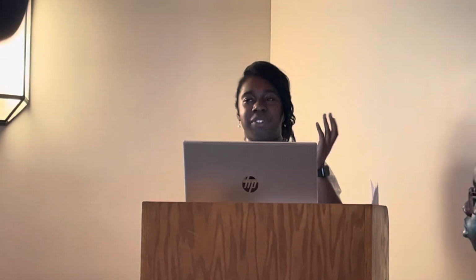And so I guess you're all wondering the big question, did the experiment work? No. So the short answer is no, but the long answer is one of the first characterization techniques that we use is called XRD, and the long name is X-ray diffraction, and it's essentially you take a sample and you use a laser and you shoot it at one angle, and then one of the receptors receives that transmission. So you're shooting it here, here, here, here, here, and it's receiving it from all of these different angles.